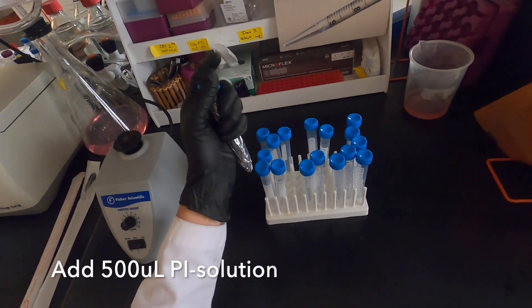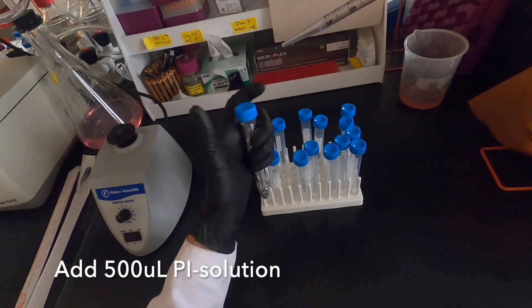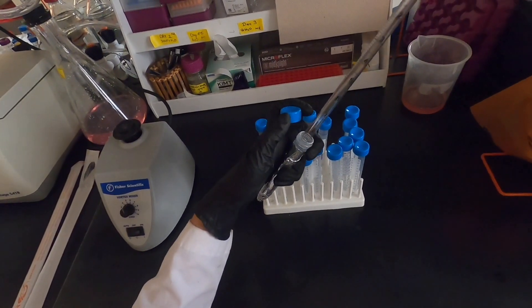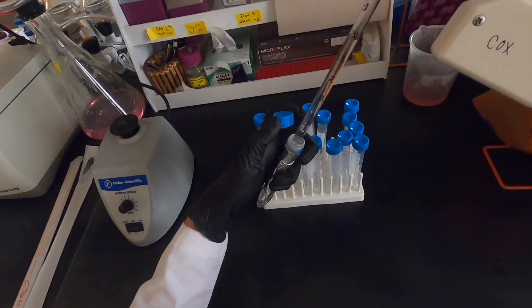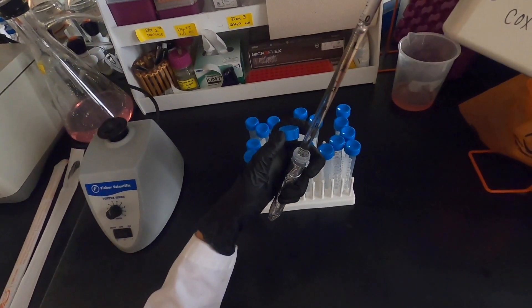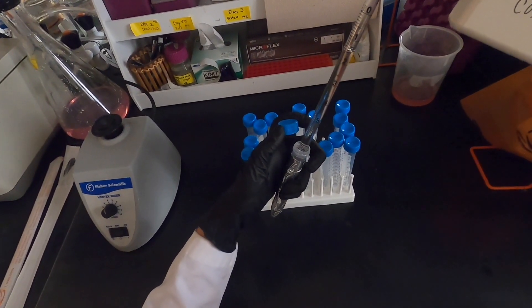Then we will add our PI solution. We will be resuspending each pellet in 500 microliters of the PI solution. The solution is stored, protected from light by wrapping it with aluminum foil. If you refer to your amino, you will see that the PI solution also contains RNase.